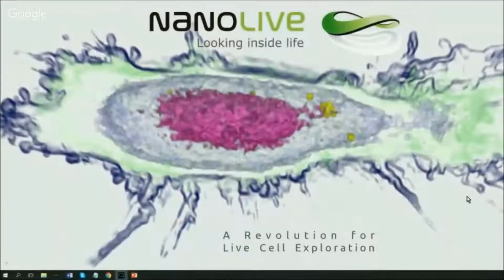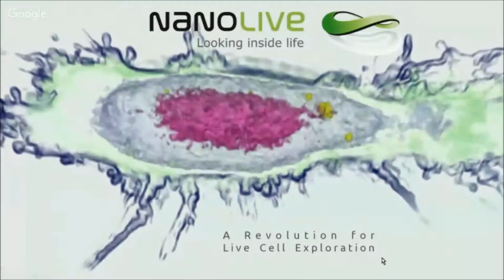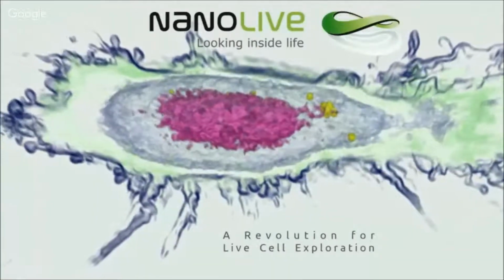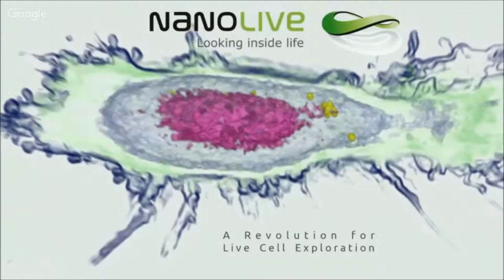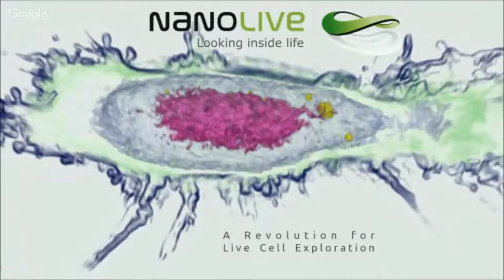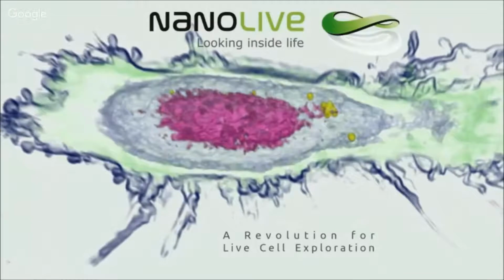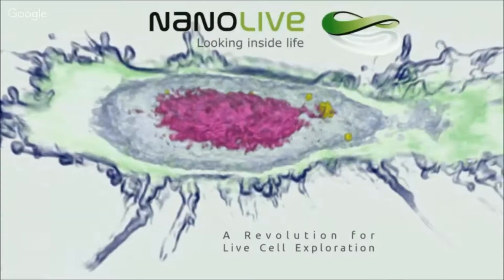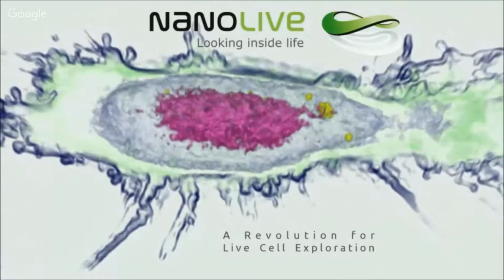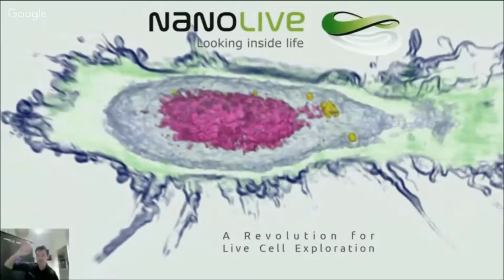Okay, I guess that we can start. And let's start from the end, as usual. So this is the final result that we want you to get. A beautiful 3D reconstruction of a cell, 3D tomography done in real time at the push of a button and in a completely non-invasive manner.